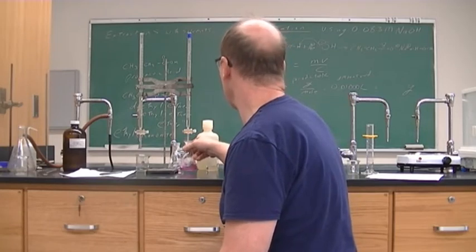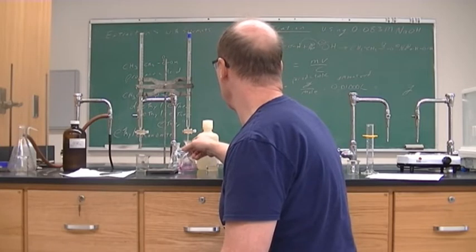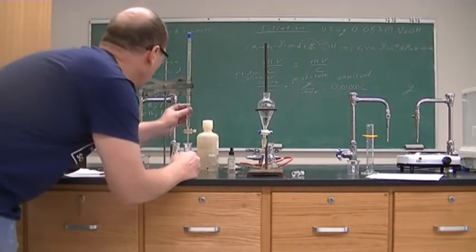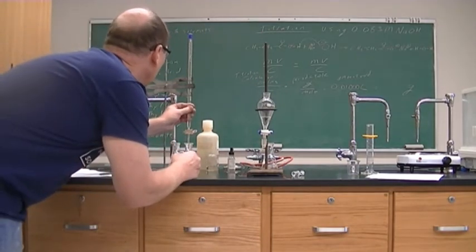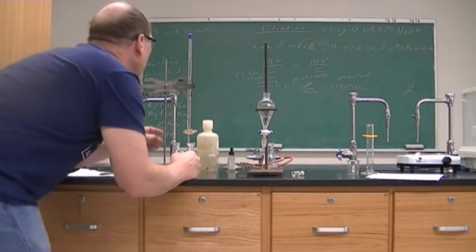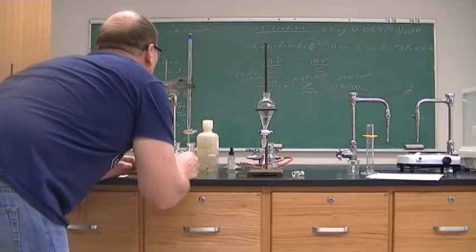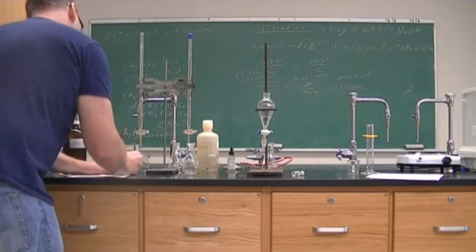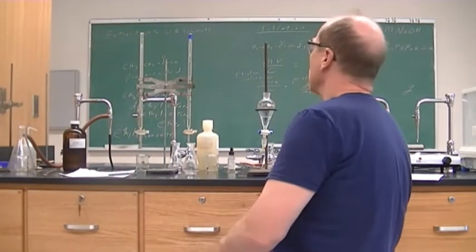Well, I took out a lot more of the acid than I thought it would. Just to make sure it's going to stay pink. Looks like it's going to stay pink. The final volume of our NaOH is 6.10. That took out quite a bit of our acid.